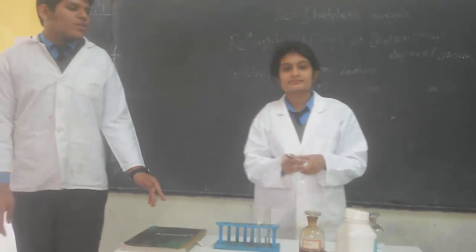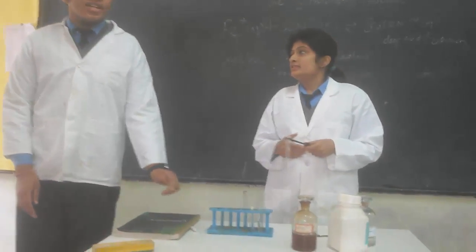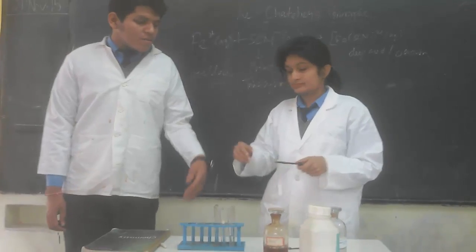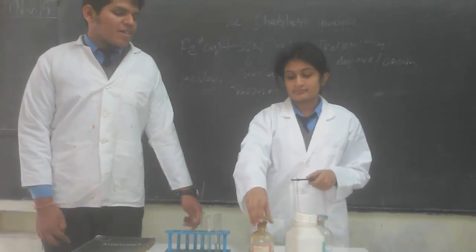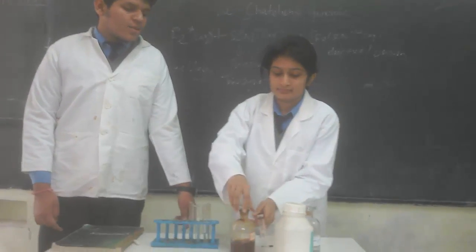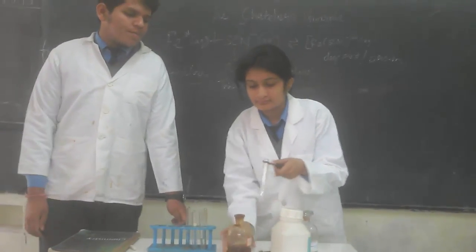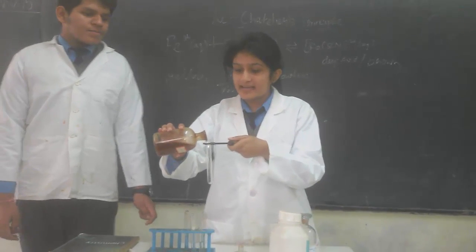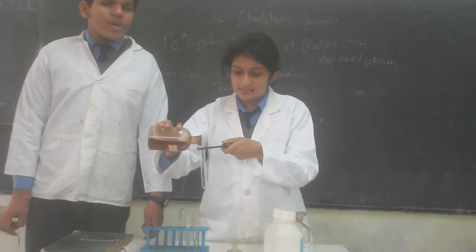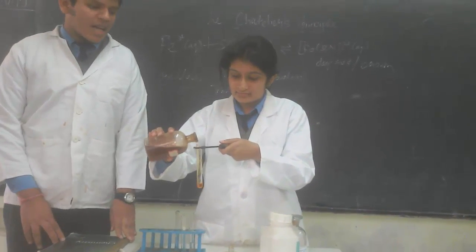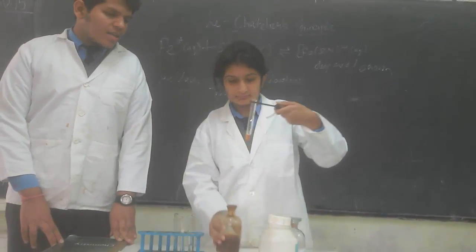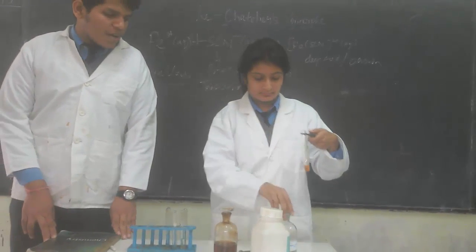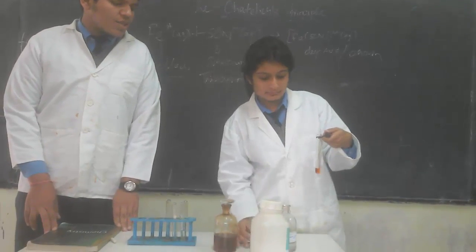Good morning. Today we are going to demonstrate Le Chatelier's Principle. First we will add the FeCl₃ solution — 1 to 1 — to get the Fe³⁺ ions. After that we will add the reaction thiocyanate solution.